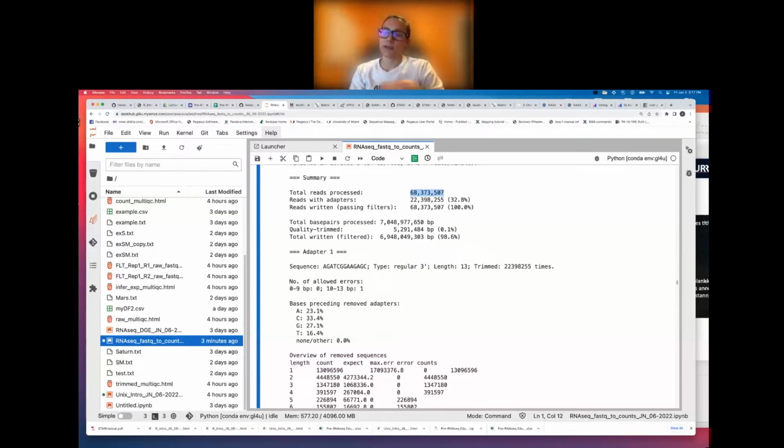If you want to view it without actually uncompressing it, which we could do if you want to, you use a sister of the cat command called zcat. That will open up a gzipped file without actually uncompressing the file, so the file will remain compressed. You'll just be able to take a picture of what's inside of it without fully uncompressing it.